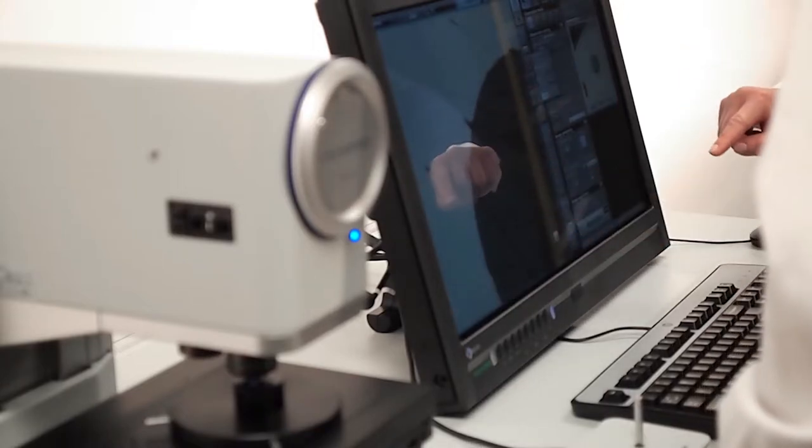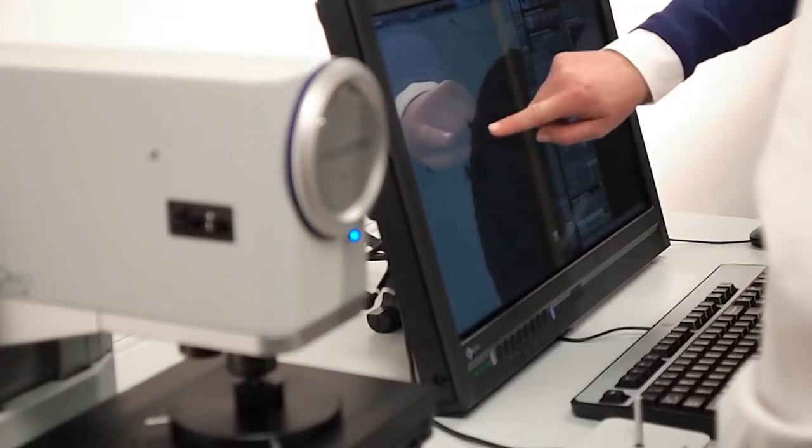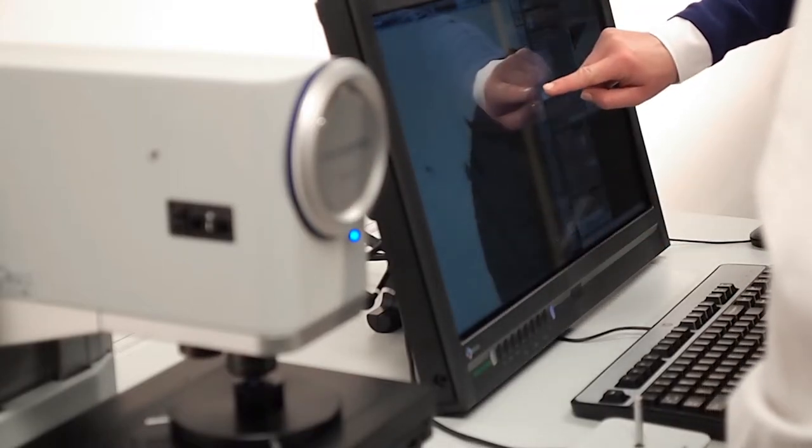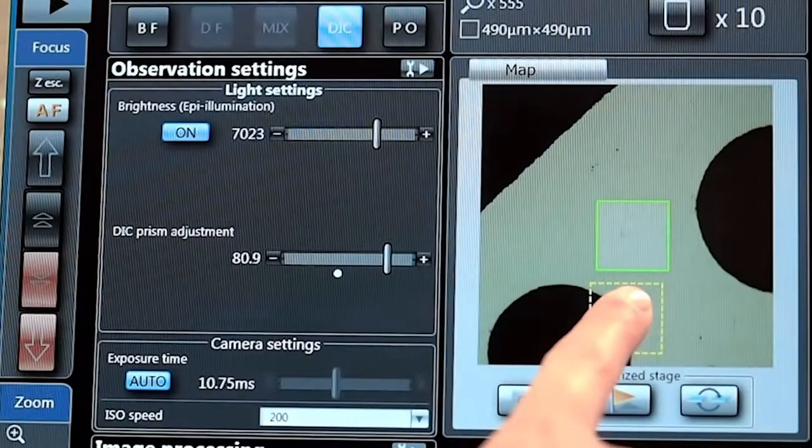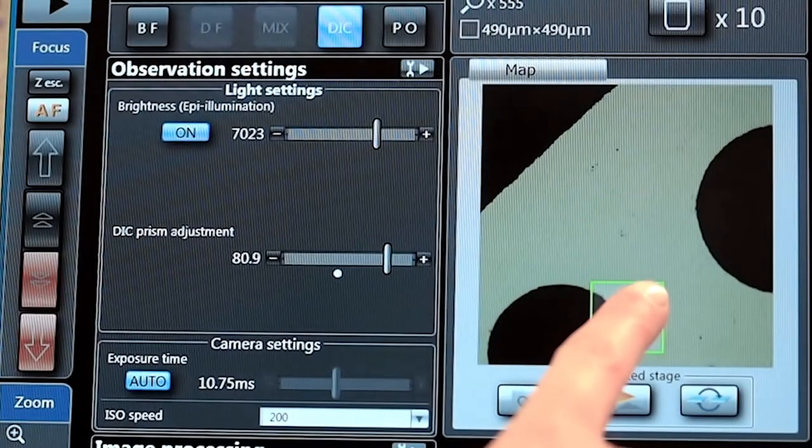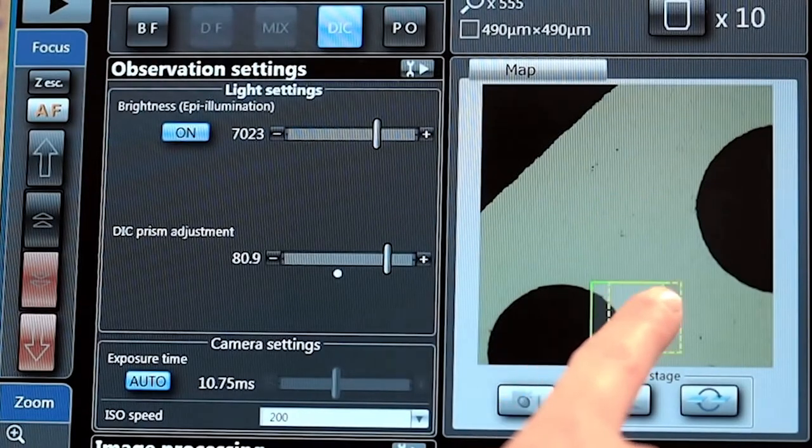To ensure that you are measuring the right part of the sample, a wide field macro map on the screen shows you exactly where you are.